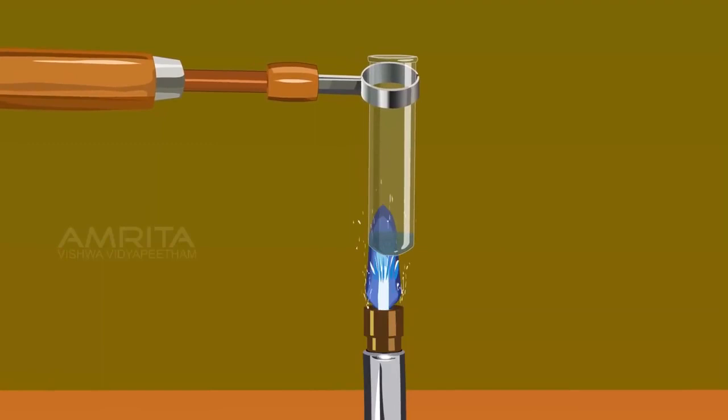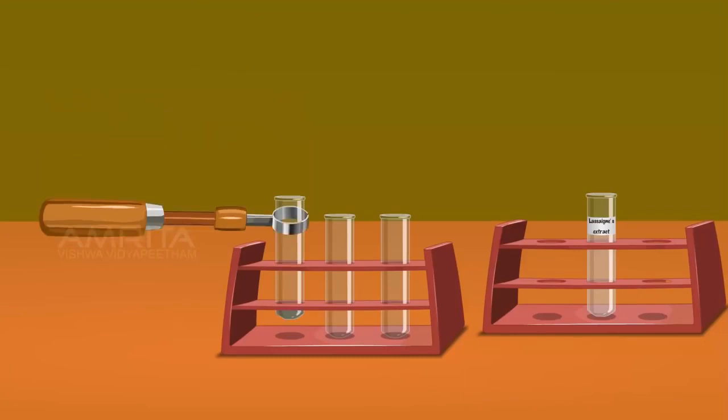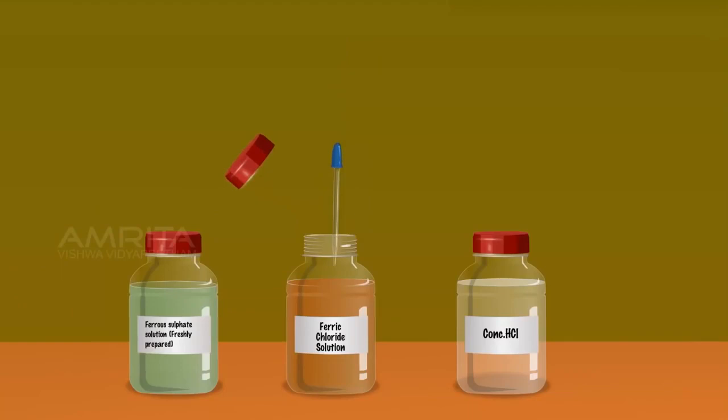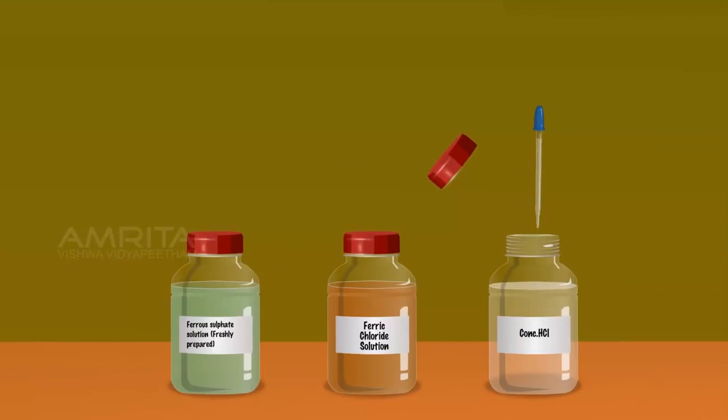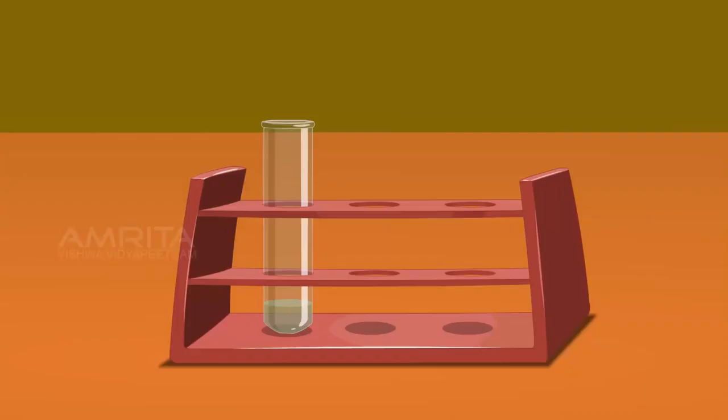Place the test tube in the test tube rack. Take a small amount of ferric chloride solution using another dropper and add it into the contents of the test tube. Using another dropper, take a small amount of concentrated hydrochloric acid and add it into the contents of the test tube. On further treating with ferric chloride and concentrated hydrochloric acid, sodium ferrocyanide forms a Prussian blue complex — ferric ferrocyanide.